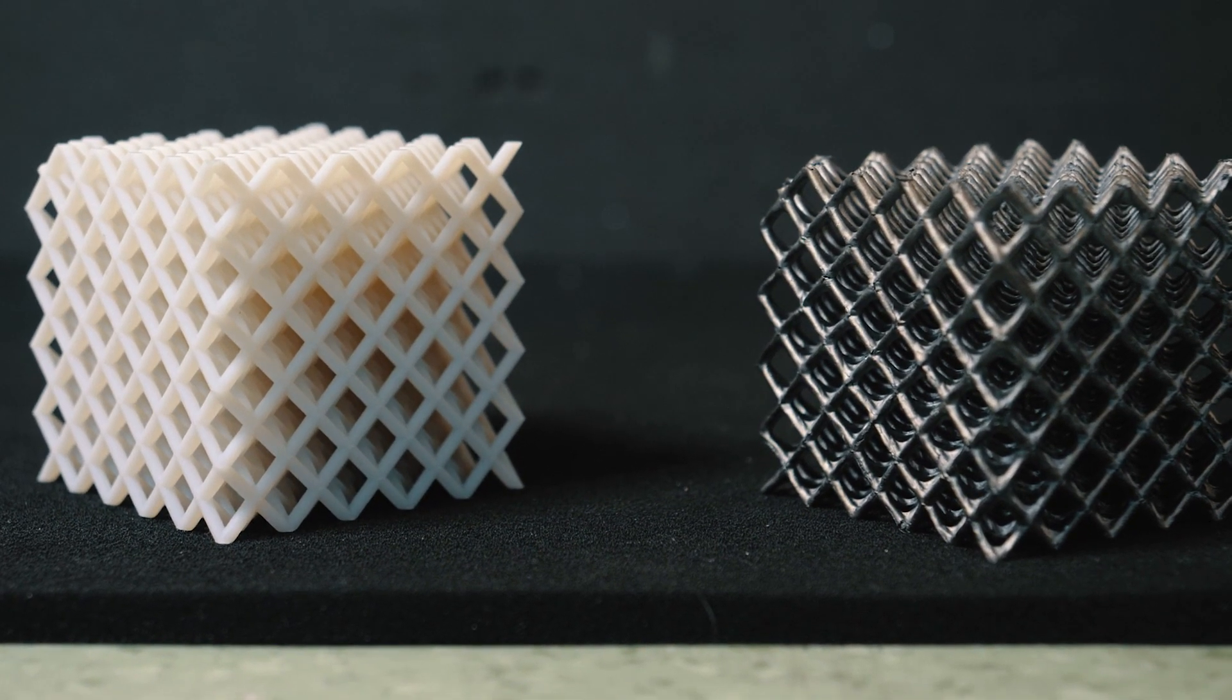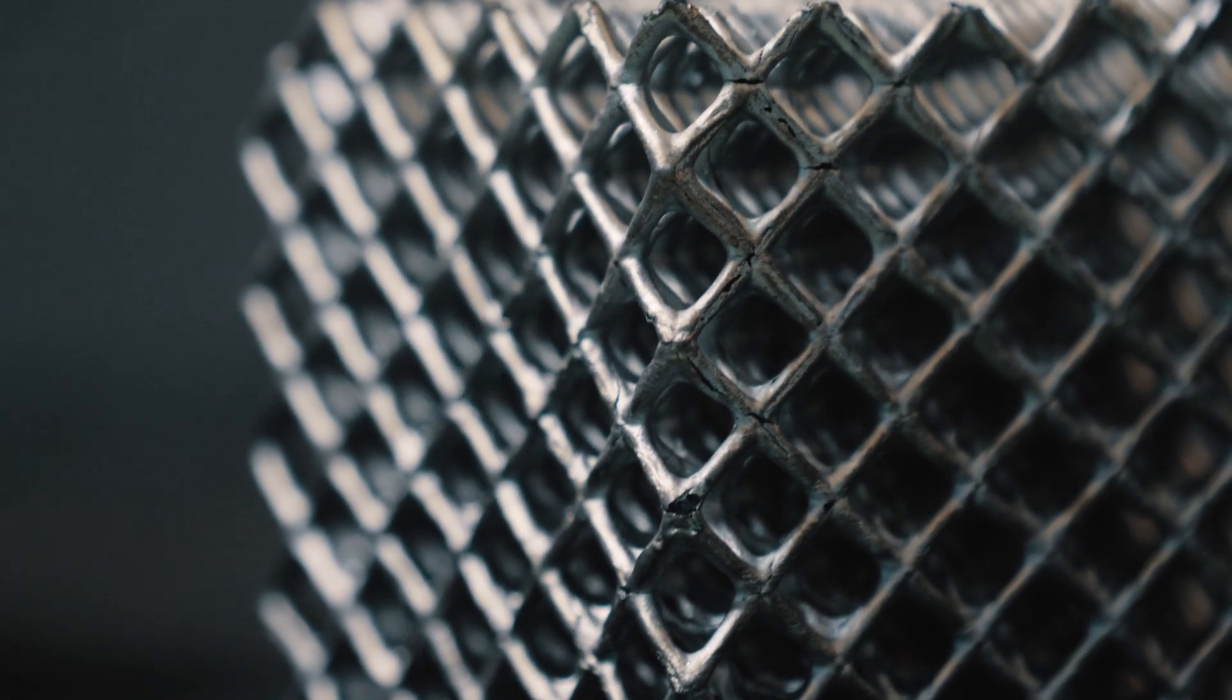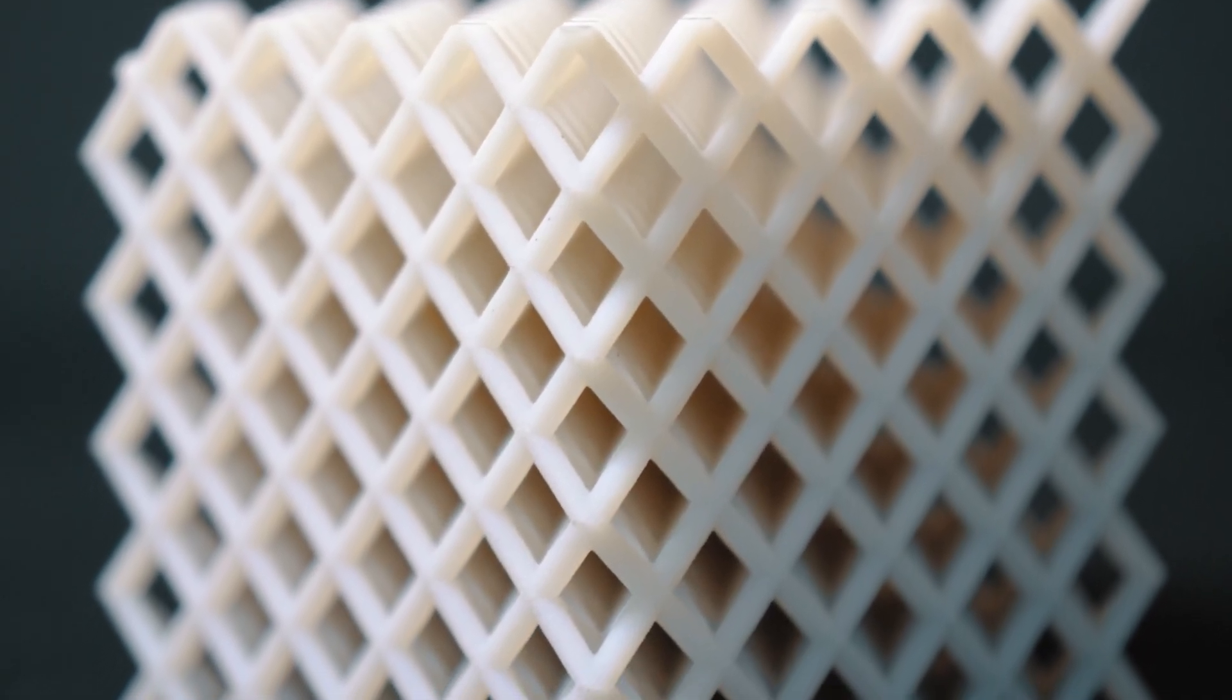Typically when we do this porous material we print a polymeric template on which we can put a ceramic paste which then after heat treatment becomes a ceramic.